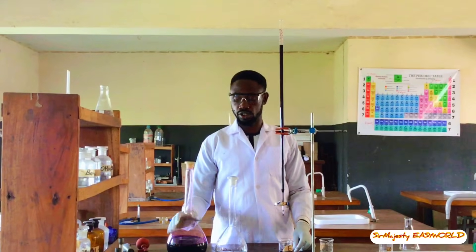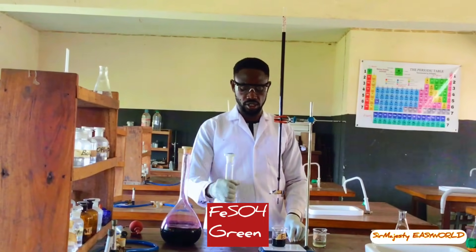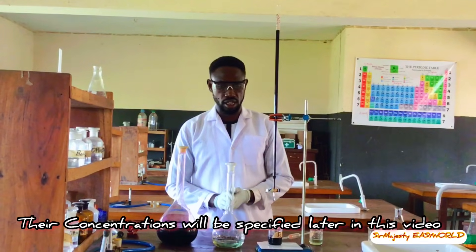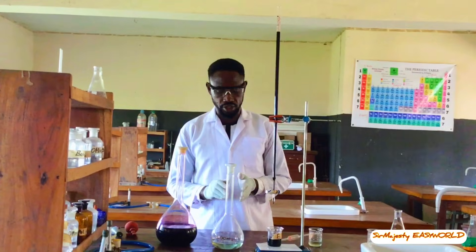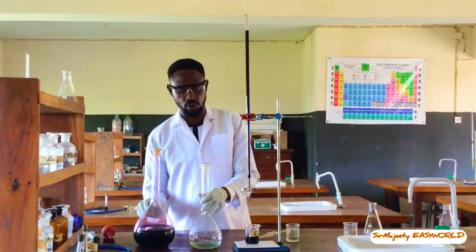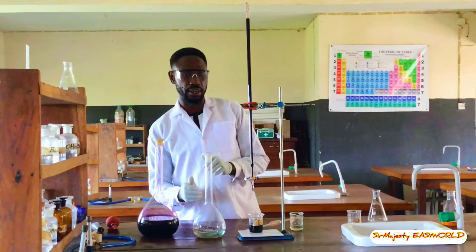Today we will be running a redox titration between potassium permanganate (Mn7+) and iron(II) sulfate (Fe2+). This is a redox titration — iron(II) is the reducing agent and permanganate is the oxidizing agent. Manganese 7+ is purple, and the iron(II) will bring it down from purple to pink, which is manganese 2+. In the other direction, iron(II) will be oxidized to iron(III), which is yellow, by the manganese itself. So we are looking at pink and yellow at the end points.